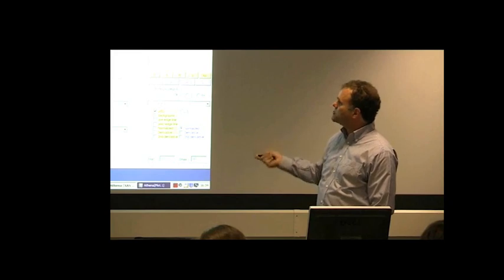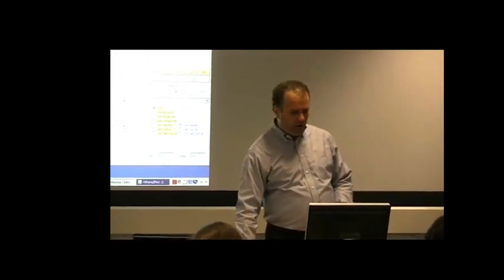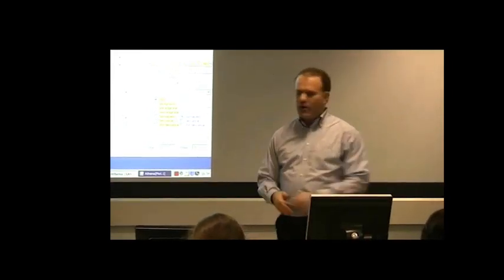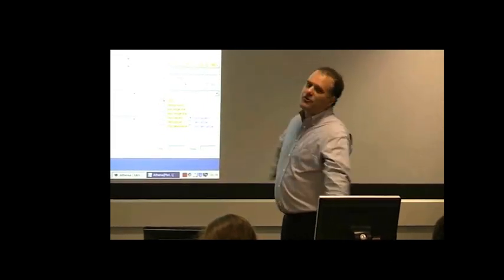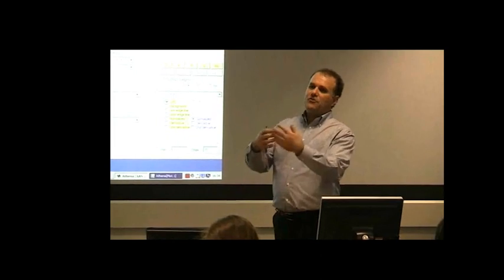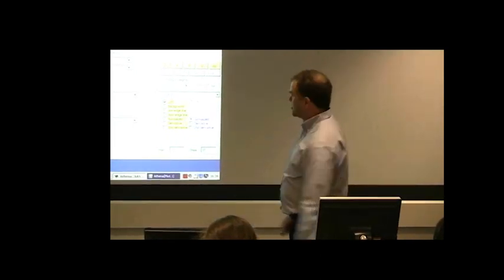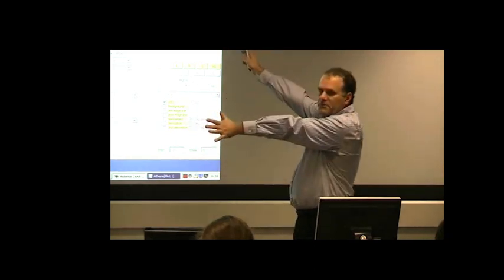What we've talked about so far, though, is the fundamentals, the stuff that you absolutely have to know how to do, and the stuff that you'll do all day long during a measurement at the beamline, which is get the data imported, set the parameters sensibly, and process your data so that you can visualize it in all the spaces.